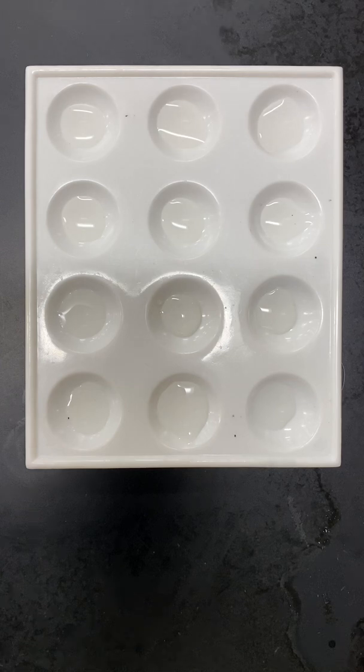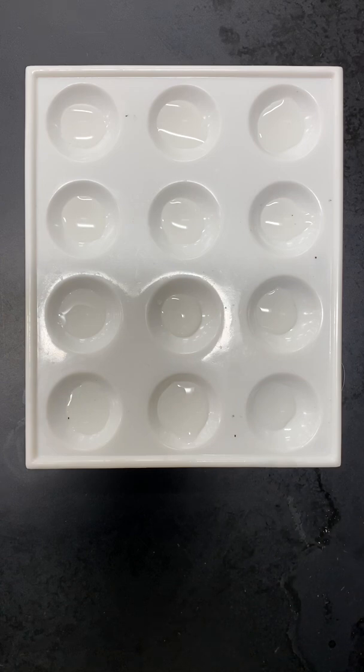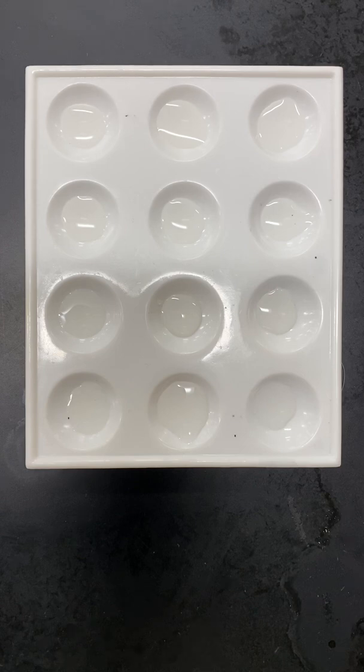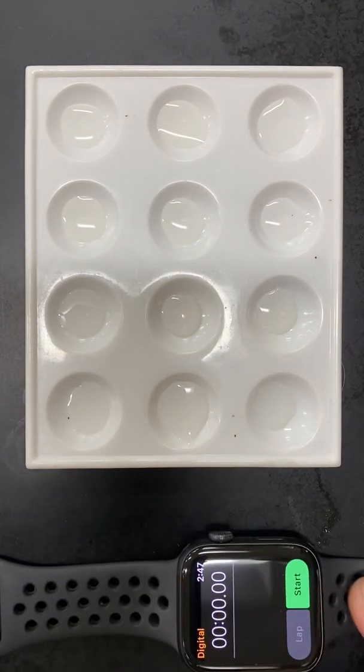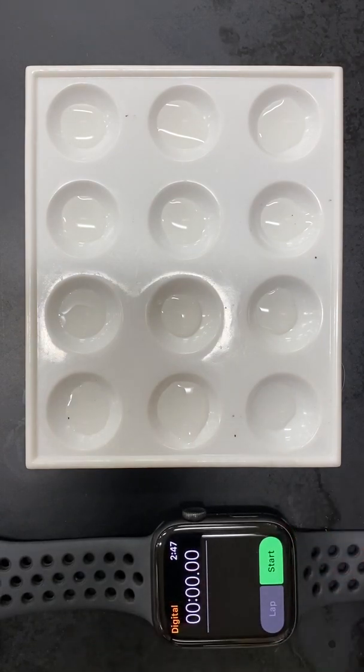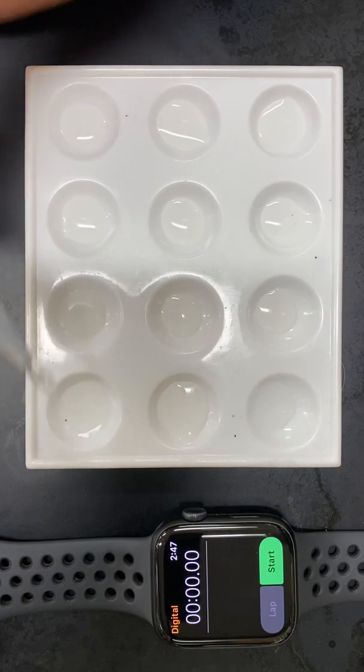Okay, so now the next thing I have to do is add 1 drop of starch to each of the wells. And at that point, I'm going to start the stopwatch. Every 30 seconds, I'll be checking in on that stopwatch. So the first thing I'm going to do is add that 1 drop of starch.